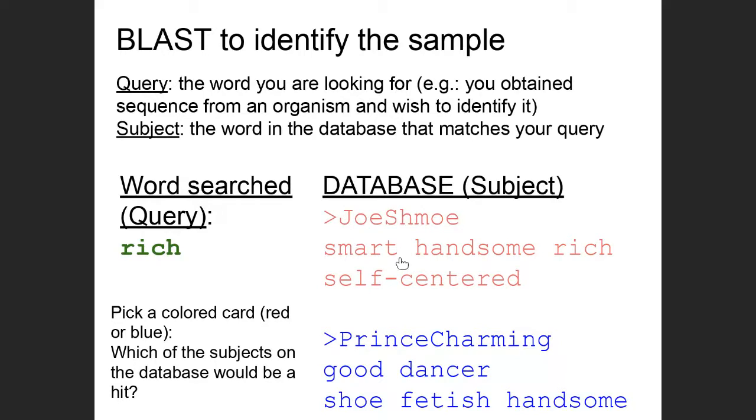And this is my silly example for you to enter. Maybe it's an amino acid sequence, and okay, there are no amino acids that are old, but in any case, it's looking for where in this sequence it matches. It doesn't have to actually look, maybe I should put an example here where the name of the guy is Rich, but that wouldn't match, because what the computer is looking for is not whether the name of your sequence matches this thing. It's looking for the attributes, if they match your query.